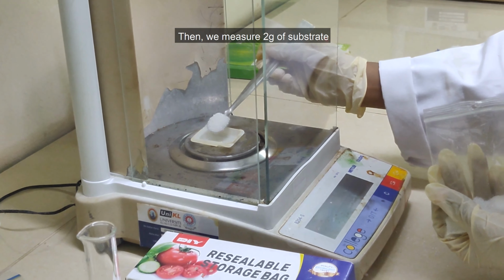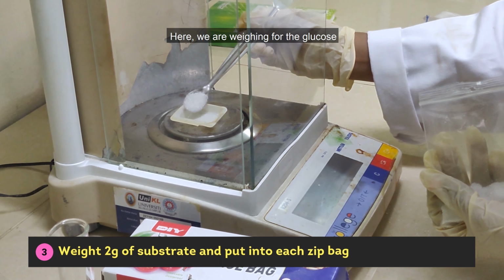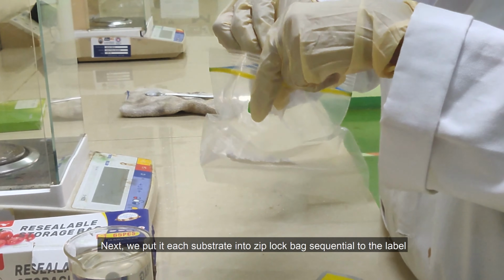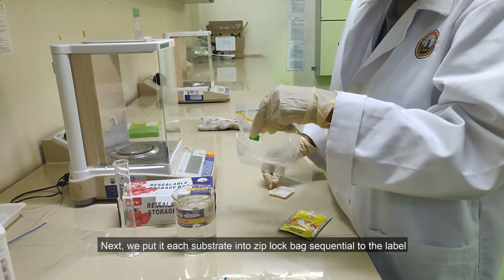Then, we measure 2 grams of substrate. Here, we are weighing the glucose. Next, we put each substrate into the Ziploc bags according to the labels.